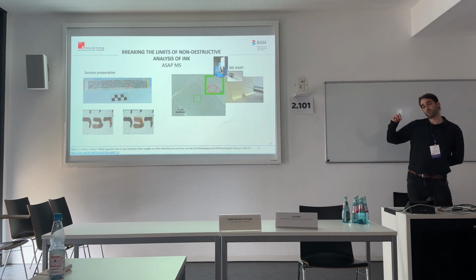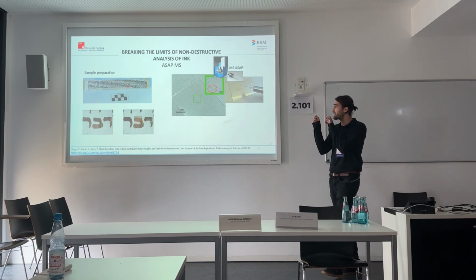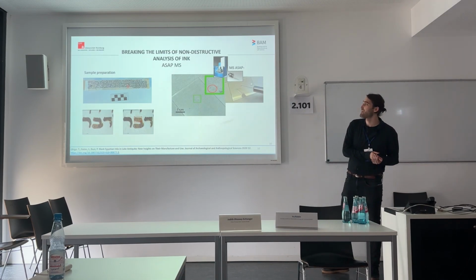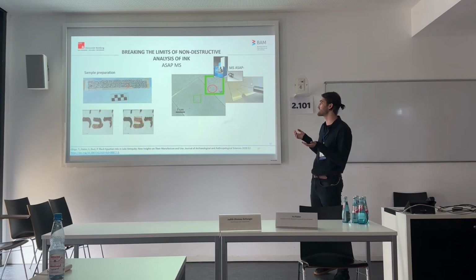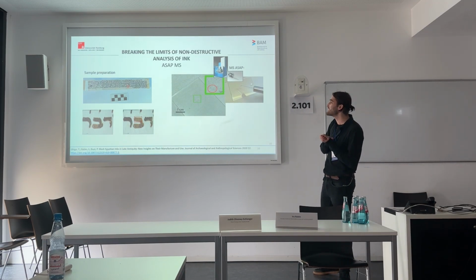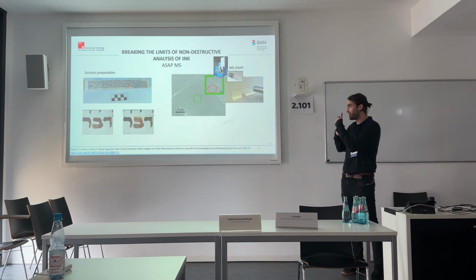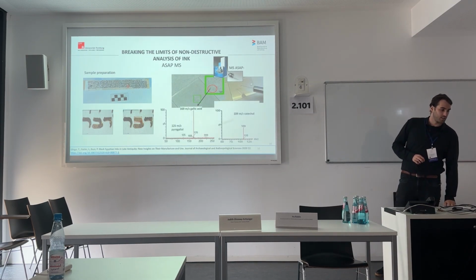First of all, to do the measurements, one has to insert the probe with the little capillary on which one collects the sample. In principle, it could be possible to collect it directly from a manuscript, but traveling with it would be very difficult. For this, we proposed a protocol in which we simply collect tiny bits of ink and close it between two panes of little glass, and then ship it or transport it ourselves to the laboratory. Then we insert it into the instrument. The whole analysis takes place, which is very fast, and we get the following information.